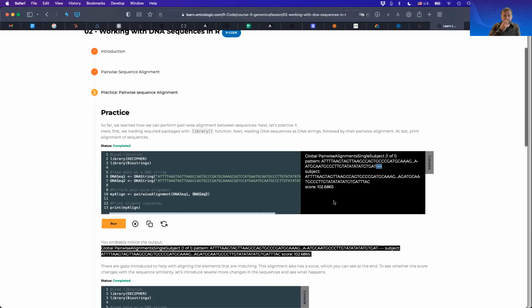Okay, yes, you can definitely practice on RStudio. The reason why we're doing this in the browser is because the browser has the answers, right? So as you are getting started, you want to be able to replicate exactly what is expected. Once it works and you understand the syntax, you can take it onto your own environment and work with that. But before you jump into that, let's make sure that you can get exactly what we have here, which also includes all of the libraries and dependencies that have to be installed and to work exactly the same for everybody who's using that. So that's why we're using the browser.